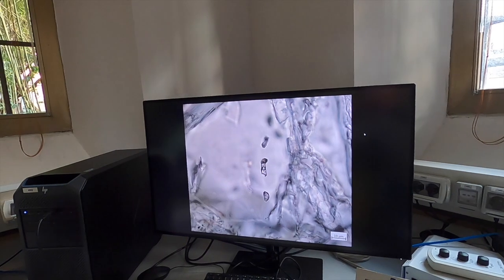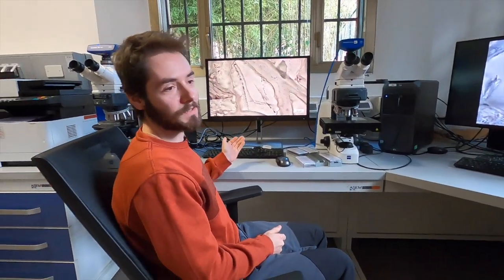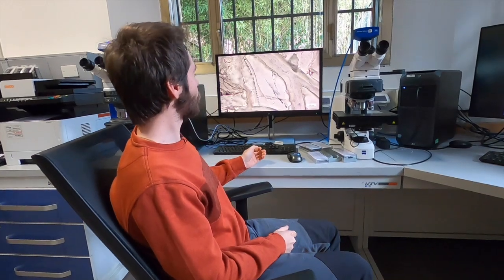My job in this project is to characterize natural hydrogen and methane trapped inside metamorphic rocks. These gases can be trapped inside minerals in what we call fluid inclusions, as you can see in this image here. Nice examples of fluid inclusions observed at the optical microscope. Fluid inclusions are tiny cavities filled with paleogeological fluids trapped in the metamorphic history, in this case, of the rock.